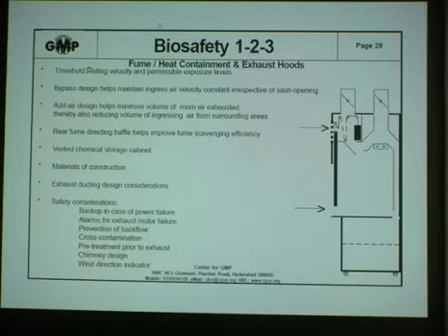You can see the perforations at the top panel where there's an arrow. And there is this sash that slides up and down. When the sash is up, the perforations are blocked and the air intake is predominantly at the work table. As the sash moves down, part of the perforations are open for air and part of the air enters from there, and the remaining amount of air is drawn at the work surface level. And there is a balance between the two such that the air entry velocity remains fixed at 100 or 120 feet per minute. This is called the bypass design.